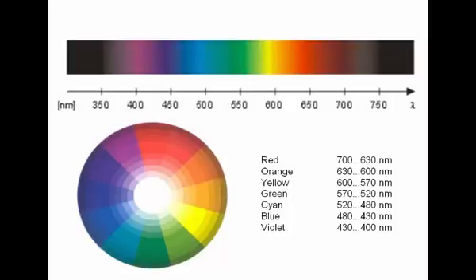Okay, a blue solution would tend to absorb in this region, which can be in the 600 region, etc. So we can use the complementary colors to figure out what we would see. It's not that easy, but that's a good approximation.